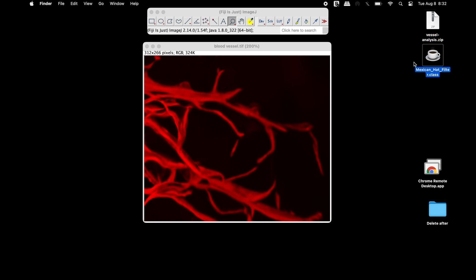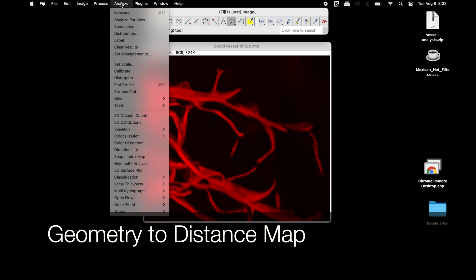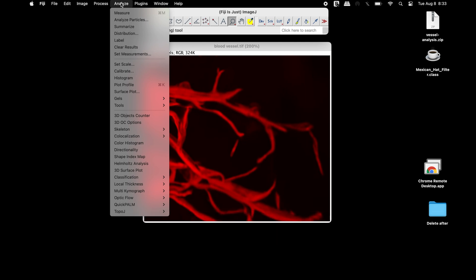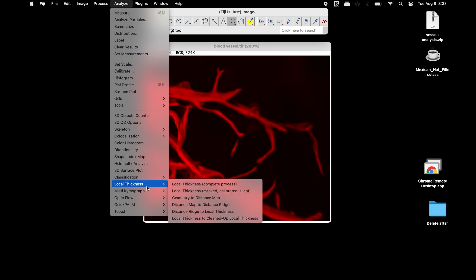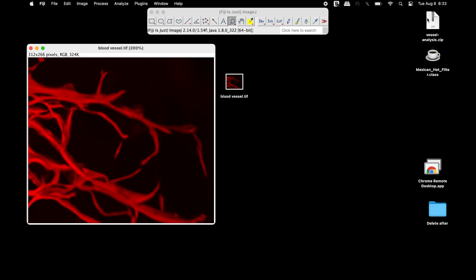Another parameter required to perform the diameter measurements is the geometry to distance map. To locate this in Fiji, click on Analyze, scroll down to Local Thickness, and find the Geometry to Distance Map.